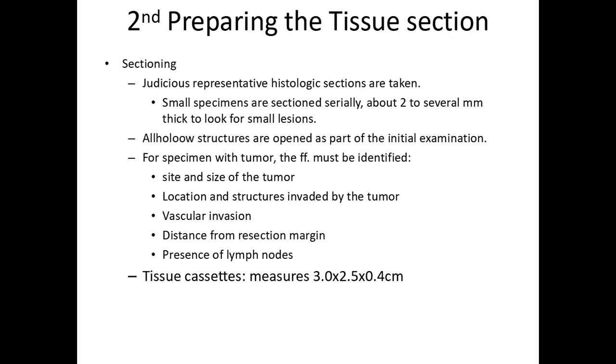No? Na siya mong ipaprocess at gagawan ng slide. No? Hindi pwede yung buong specimen na yan, i-chop mo ng maliit, and then lahat gagawan mo ng slides. Napakadami nun. No? So we only have to choose a representative sample from the specimen that we receive.